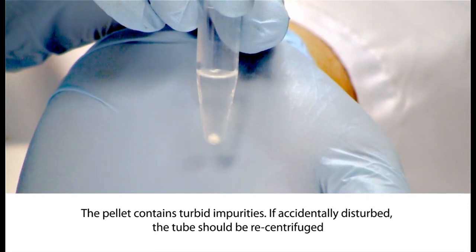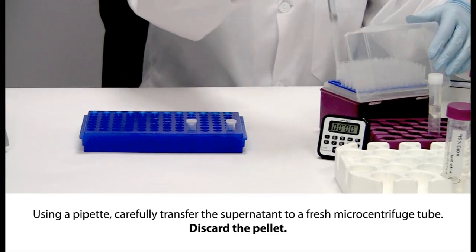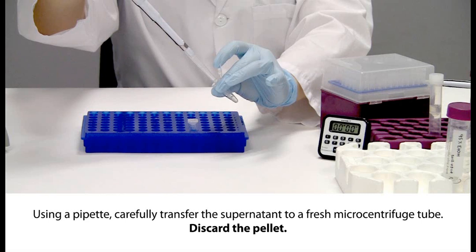The pellet contains turbid impurities. If accidentally disturbed, the tube should be recentrifuged. Carefully transfer the majority of the clear supernatant with a pipette to a fresh microcentrifuge tube. Discard the pellet.